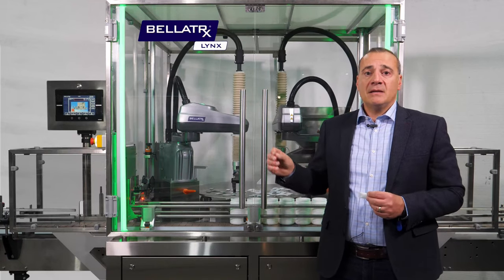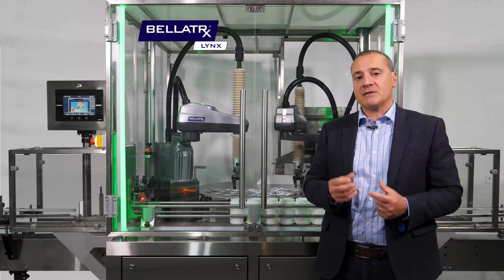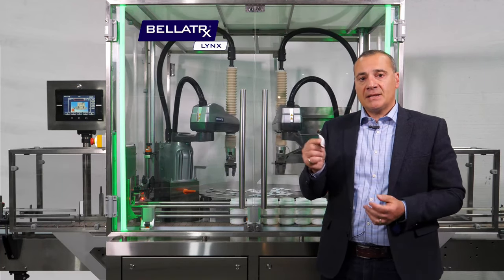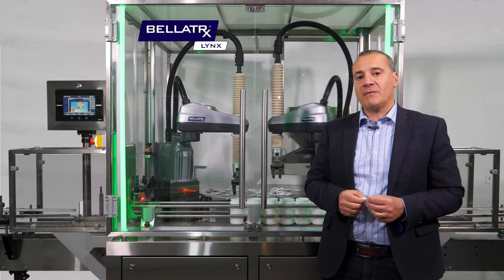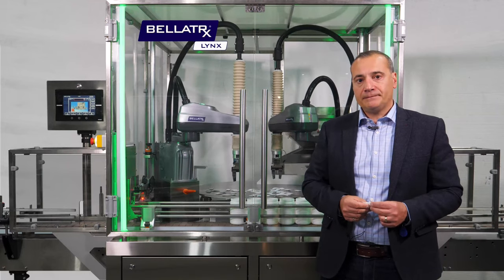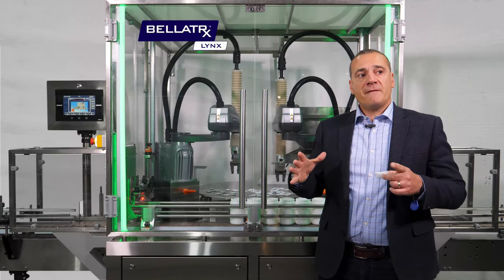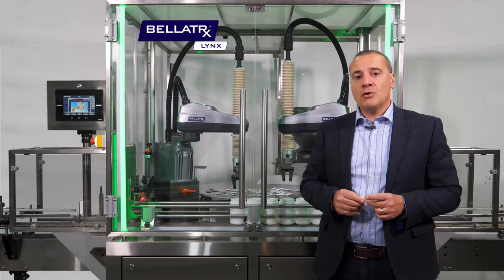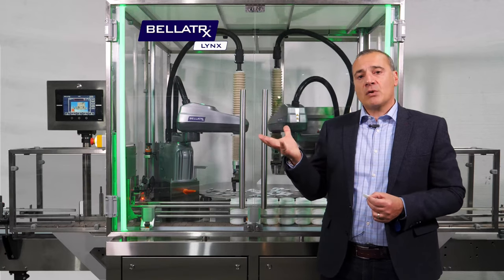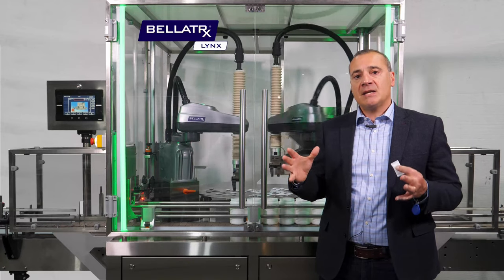Once picked, the robotic arms move on top of the bottle. We have a sensor in each end effector — the end-of-arm tooling on each robot — to make sure that we grabbed a desiccant and that we've dispensed a desiccant into the bottle. That allows us to confirm there is a drop of desiccant into each bottle. The arm will go back and try to pick a second desiccant. If the picking area is exhausted and there are no more desiccants to pick correctly, or they are in an orientation where we cannot pick, the rotary table will index, shaking back and forth, allowing us to spread the desiccants into different configurations.